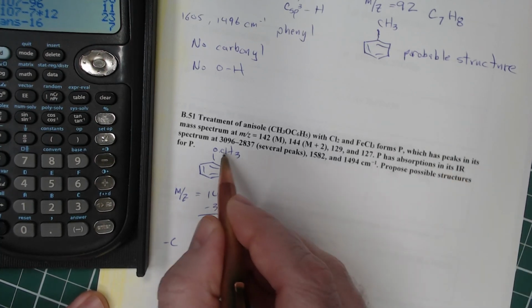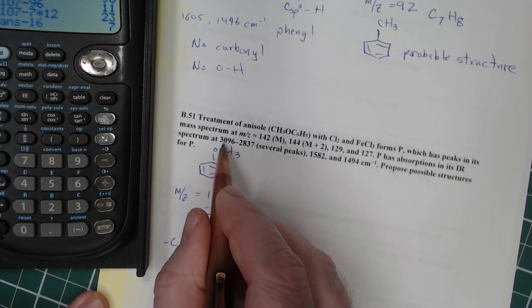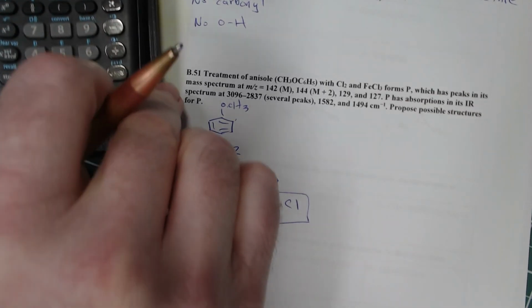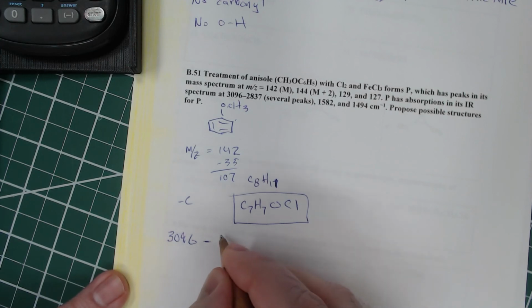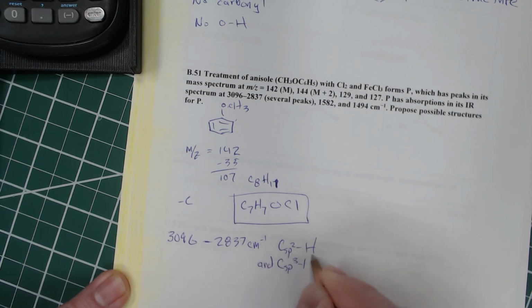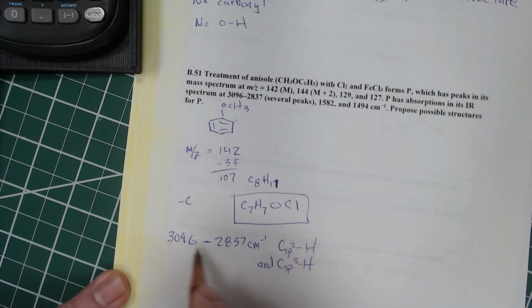All right, the IR has 3096 to 2837. That tells us that we have carbon sp2 hydrogens and carbon sp3 hydrogens, because we have it on both sides of 3000.